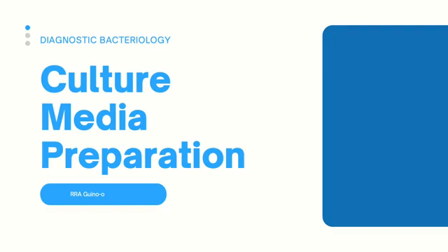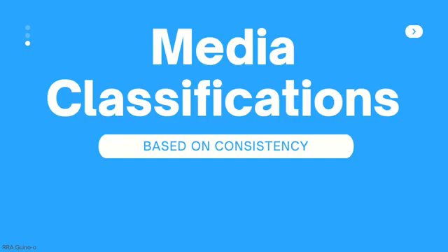Hi everyone. Today we will be discussing culture media preparation in the diagnostic bacteriology laboratory. Media can be classified based on their consistency, and for this classification there are three types.